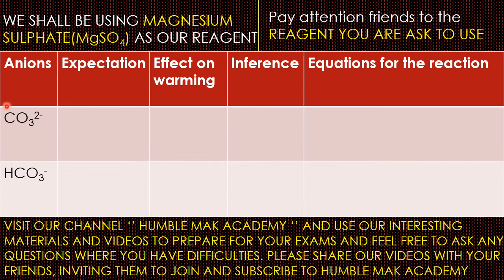So guys, if to a solution that contains the carbonate ions you add magnesium sulfate, what you expect to see is a white precipitate. What you expect to see if it was the carbonate ion is a white precipitate. So once you've seen this, you know that it's the white precipitate.